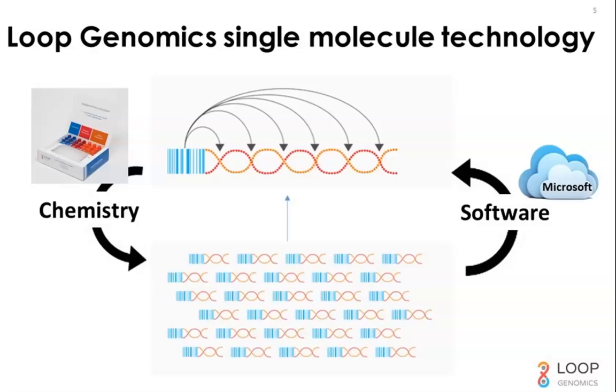We actually have a publication in the final stages comparing LoopSeq 16S sequencing to PacBio sequencing data, and I can give you a sneak preview. The similarity between LoopSeq full-length 16S sequencing and PacBio and Oxford Nanopore data is that they all provide full-length 16S sequencing. The two, maybe three major differences are, first, as Nick mentioned, the sequence accuracy.